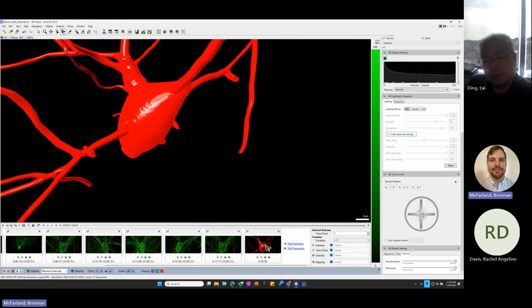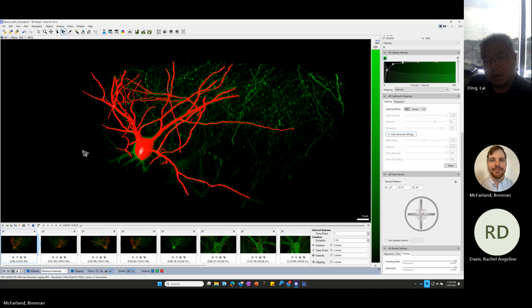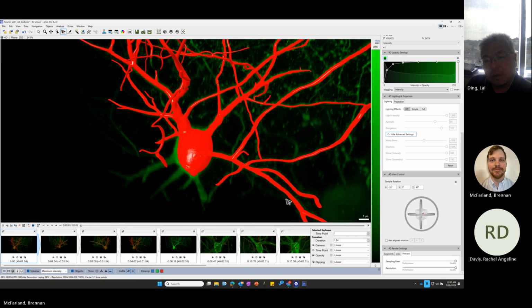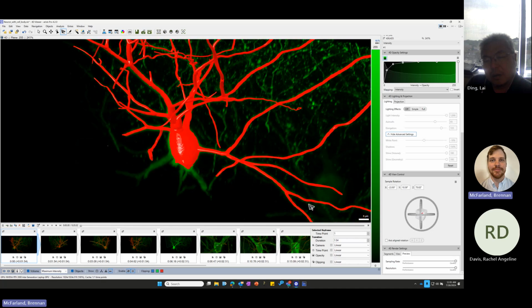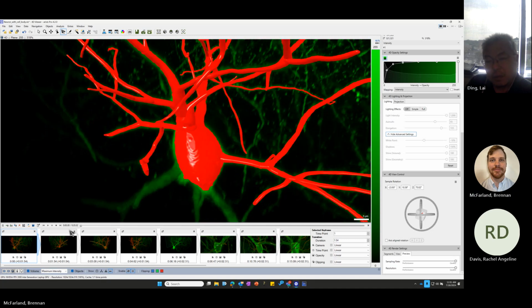Oh, wait, I don't want to do that. Go back here. Get it in the right angle.